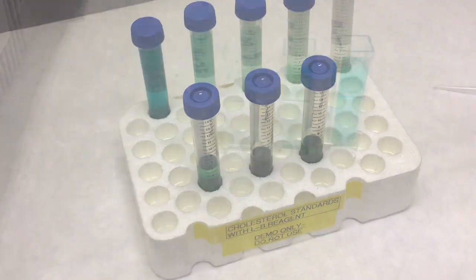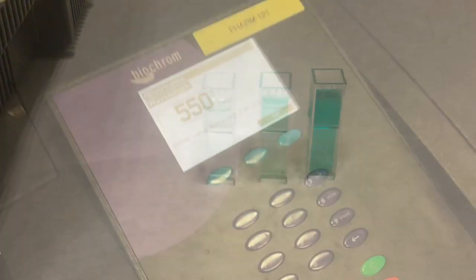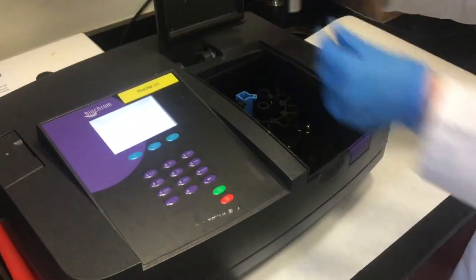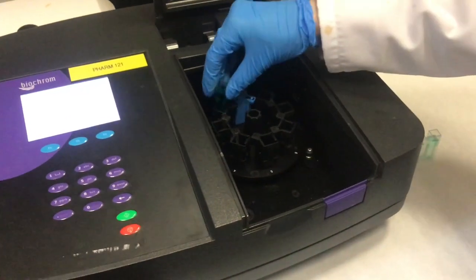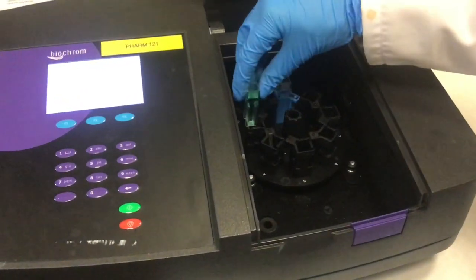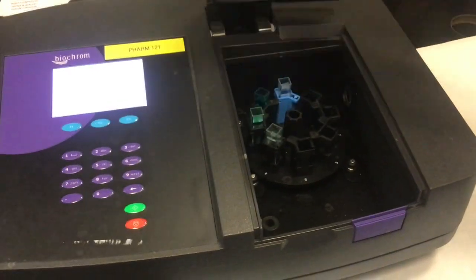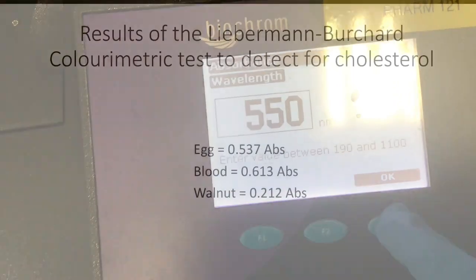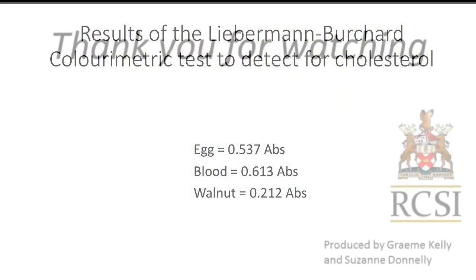The three samples are then transferred into cuvettes and will be run on the UV-VIS photospectrometer. Chloroform is used as a reference, and the samples are run at 550 nanometers. You can determine the concentration of your samples by inserting the absorbance values into your standard curve.